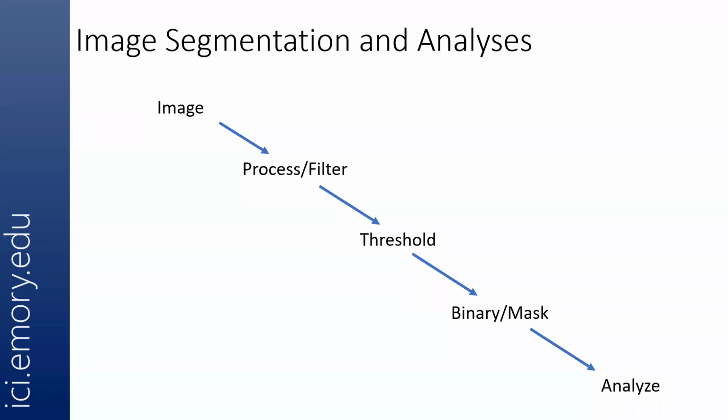Everyone's had a chance to play around with the filters and asked some really good questions. Hopefully you're in a better position to use them in the future. We're going to move into segmentation and quantitative analysis now. I'm going to go over the exercises we're going to do the rest of the session. I'm going to cover the concept of deconvolution briefly here because it's pertinent, but we won't be doing deconvolution in the class today or in the seminar today.